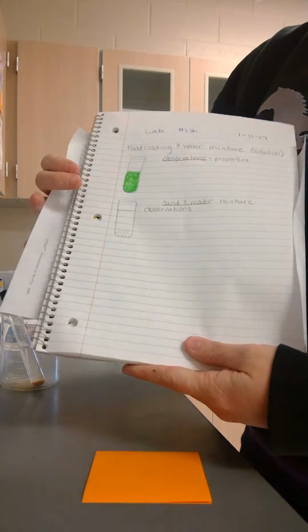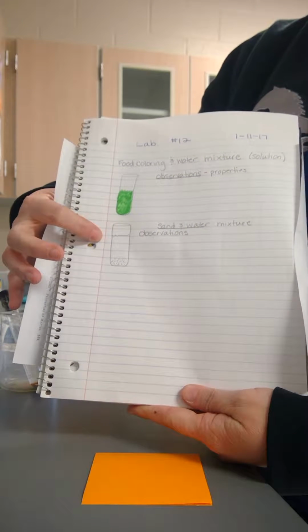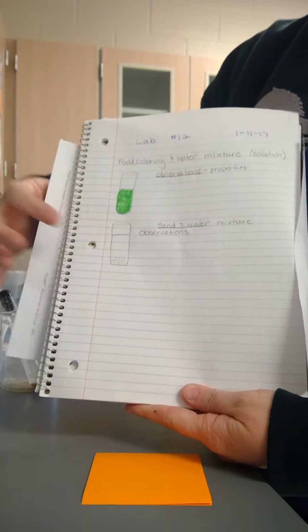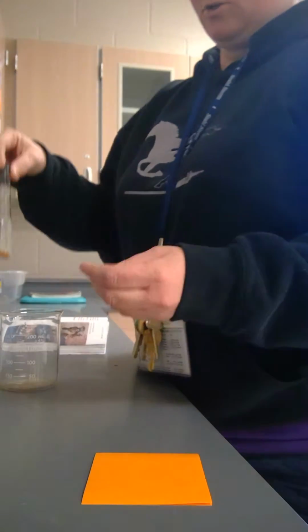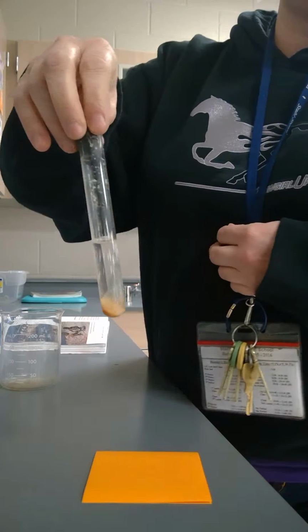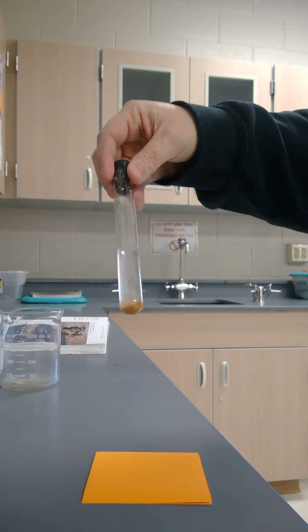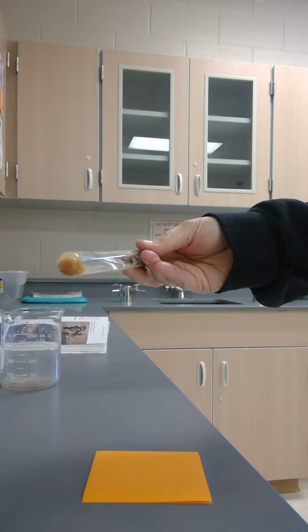Our next substance that we're going to look at is a mixture of sand and water. Sand and water, again, looking for observation properties. So same idea, I have a test tube, and inside this test tube I have put together sand and water.